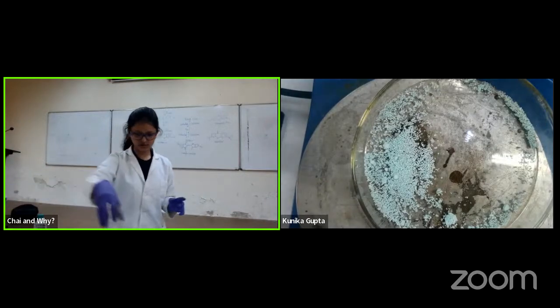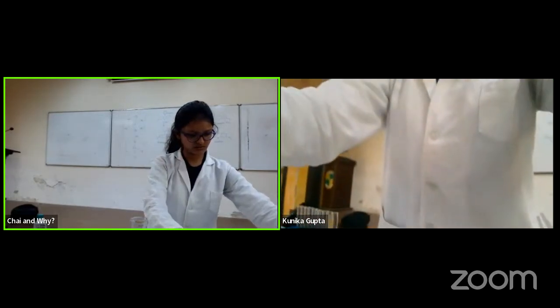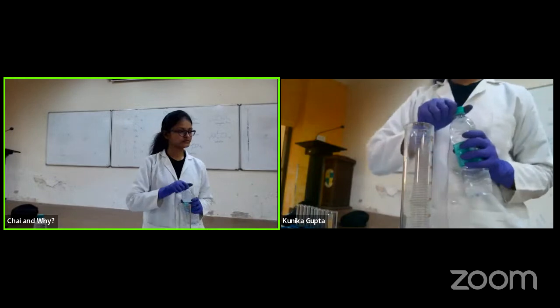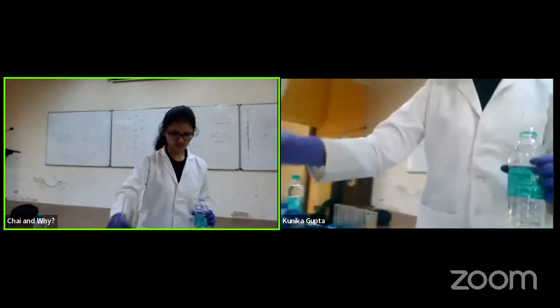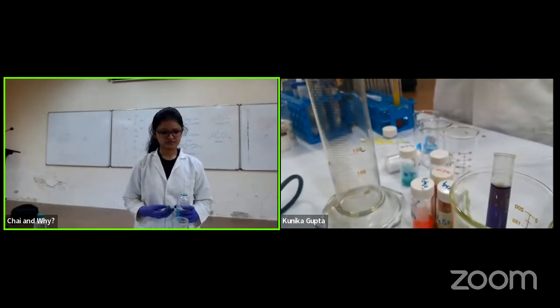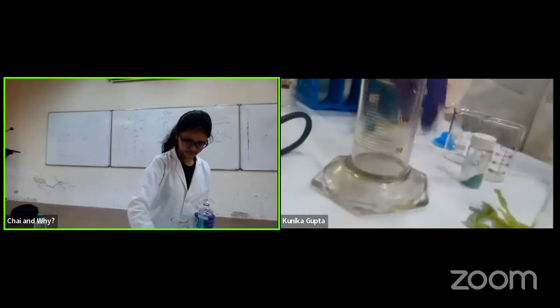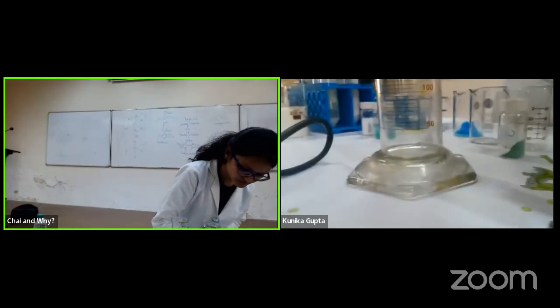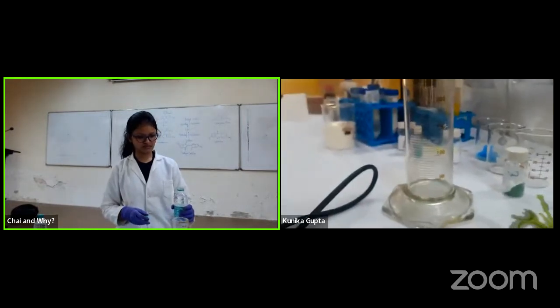So one I will take from here. So now switching the camera. You see here, right, a vessel. I add water to it. Wait. 1 minute, 1 minute. We are getting blocked by all this. So why don't we keep this somewhere here? Yeah, okay. Maybe here. Okay. Fine. One second, I'll just adjust the camera. Yeah, go ahead, add the water.